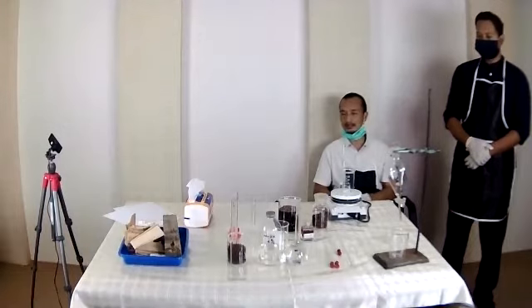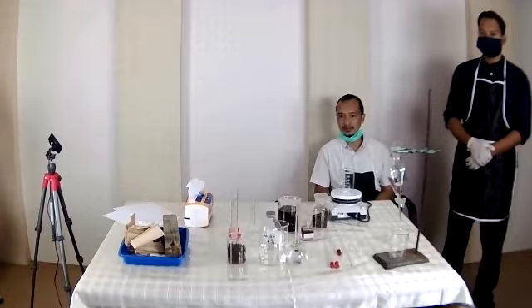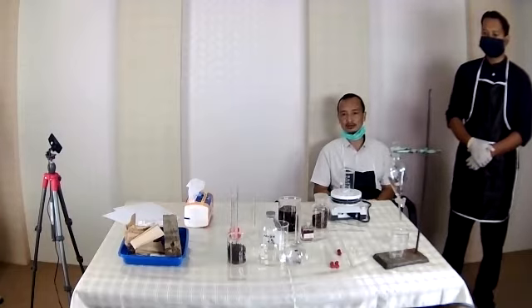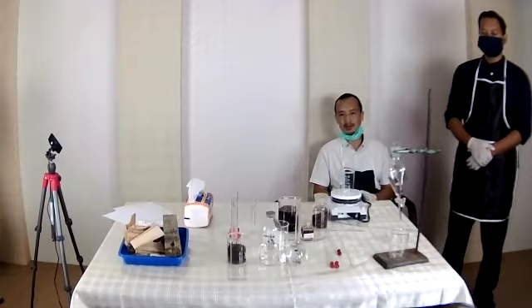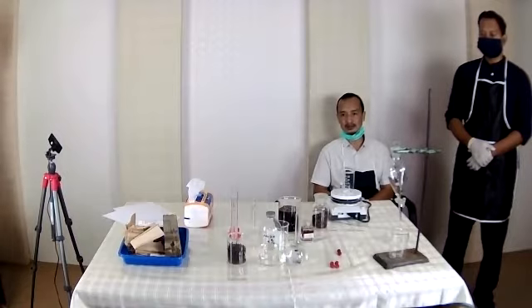So after the introduction, Ahmad and Santoso will help me in this practice. We talked about conservation. This is traditional conservation, taken from a traditional method from Kudus, Central Java. What they used to conserve wood items, among others, is banana stalk, or part of the banana trunk, and also tobacco solution.